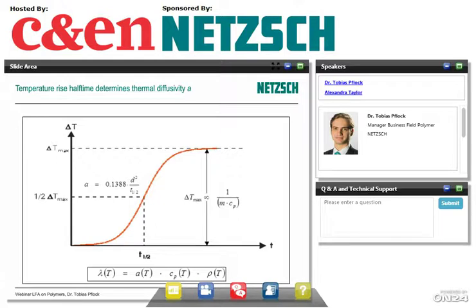You see here in the middle it's written as the parameter A. This is nothing else but the thermal diffusivity. We call this number thermal diffusivity. And it's a direct measure for the ability of the material to transport the heat.